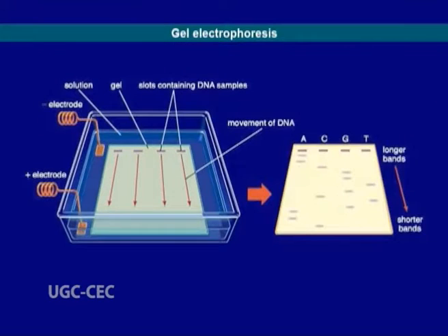In the Sanger method, which became the more commonly employed of the two approaches, DNA chains were synthesized on a template strand, but chain growth was stopped when one of the 4 possible dideoxynucleotides, which lack a 3' hydroxyl group, became incorporated, thereby preventing the addition of another nucleotide. A population of truncated DNA molecules was produced that represented each of the sites of the particular nucleotide in the template DNA. The molecules were separated according to size by electrophoresis, and the nucleotide sequence was deduced by a computer.